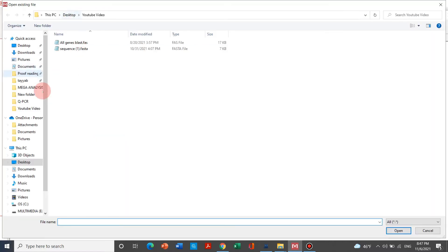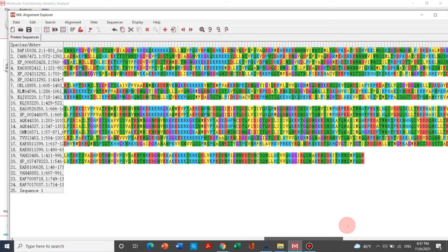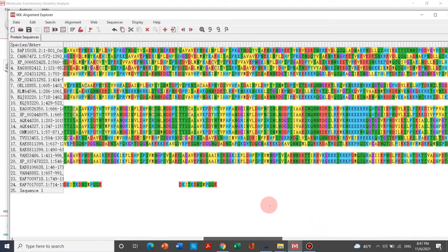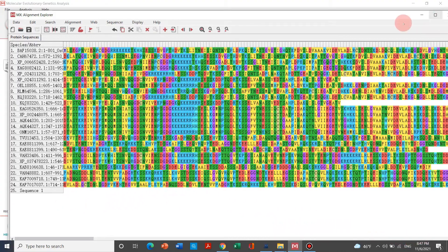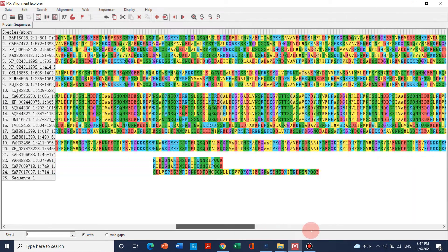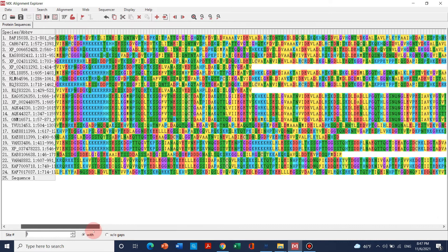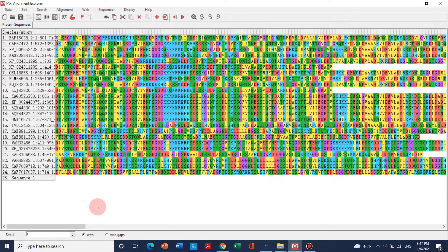We can go to Edit and select 'Insert Sequence from File,' then just click. I will go to the folder I have placed on the desktop. In this folder we can see all the sequences which we need for our phylogenetic analysis. What we need to do first is align all these protein sequences.